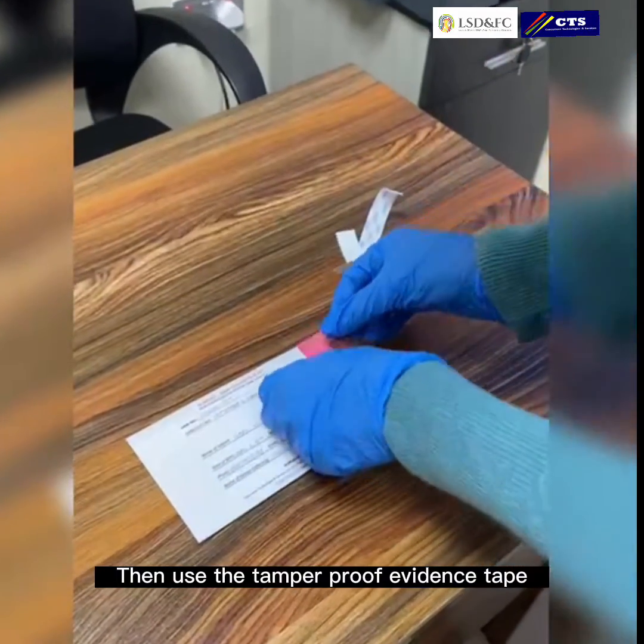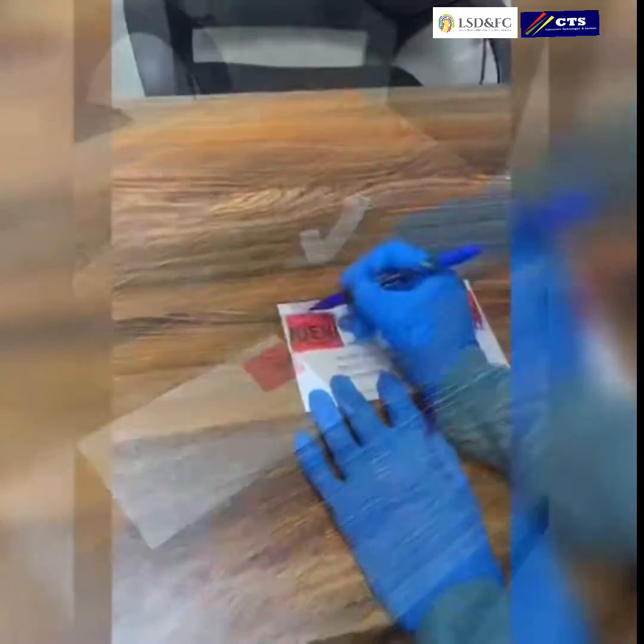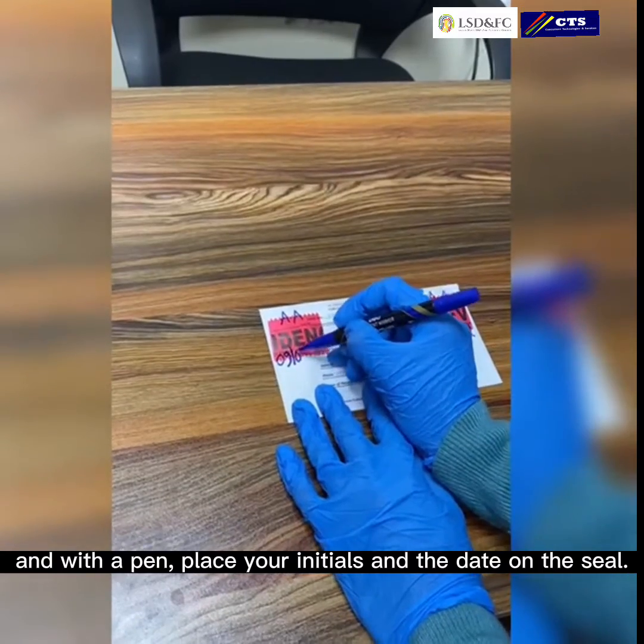Then use the tamper proof evidence tape, and with a pen place your initials and the date on the seal.